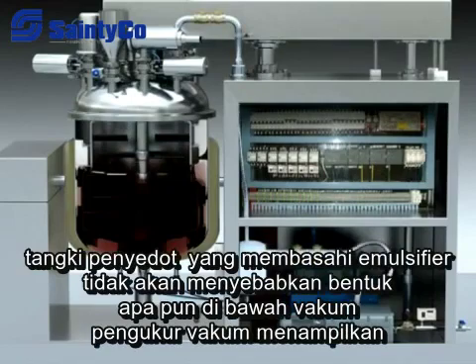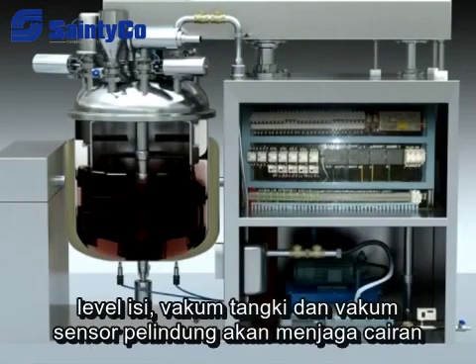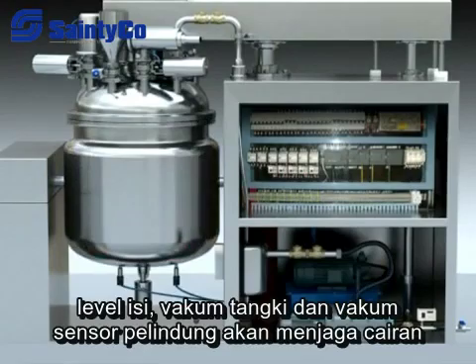The emulsifier will not cause any foam under vacuum. The vacuum meter displays the vacuum degree of the tank and the vacuum protective sensor keeps the liquid pressure in normal state.